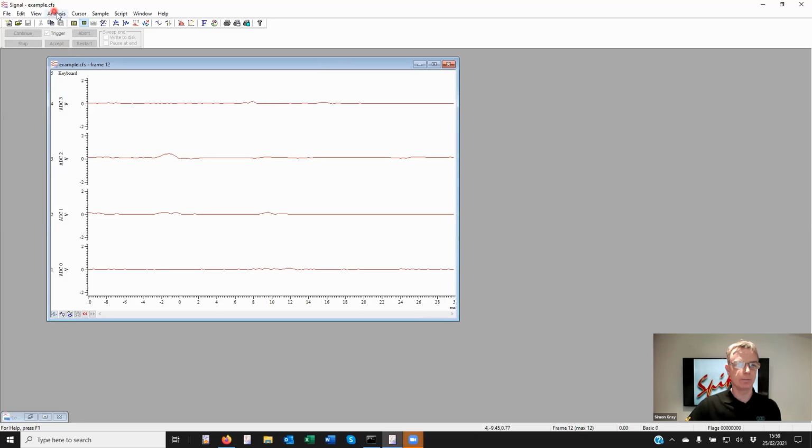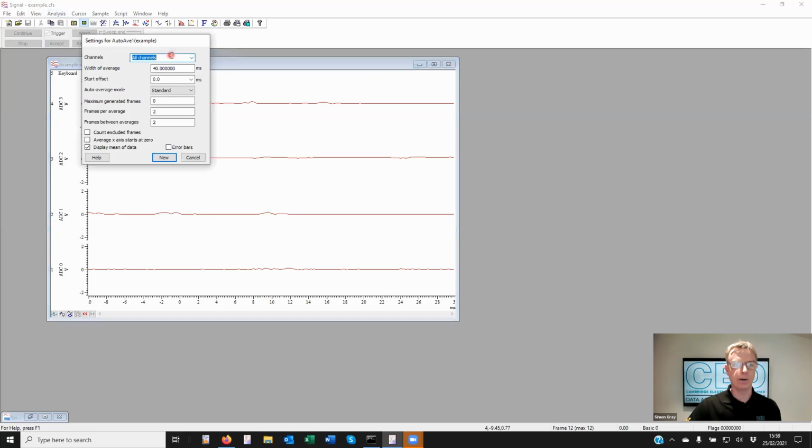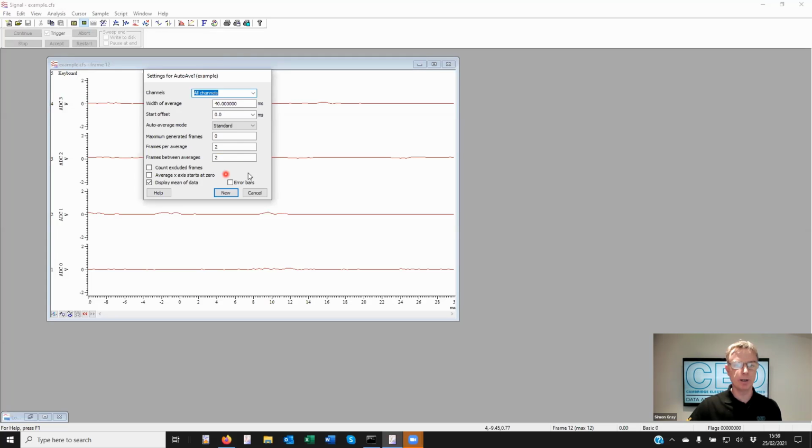I think Simon Gray got on to talking about some of the new memory views you can create. You did talk about the waveform average, and mentioned that there are other memory views we can create. I look at the auto average. It's very similar, but it produces multiple averages. So the upper part of the dialog here is the same as before.